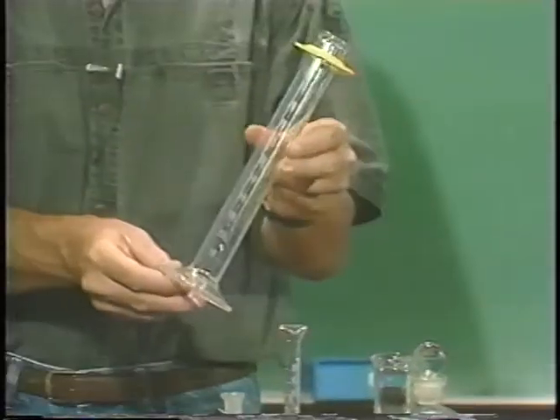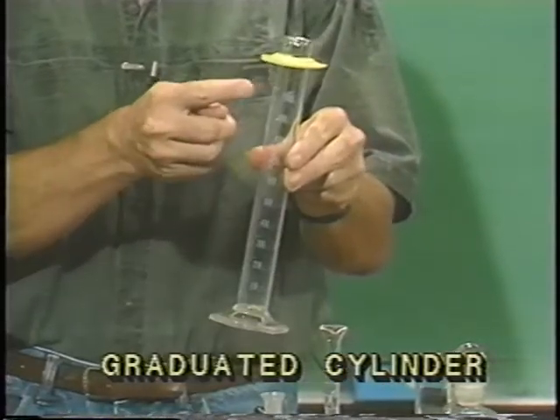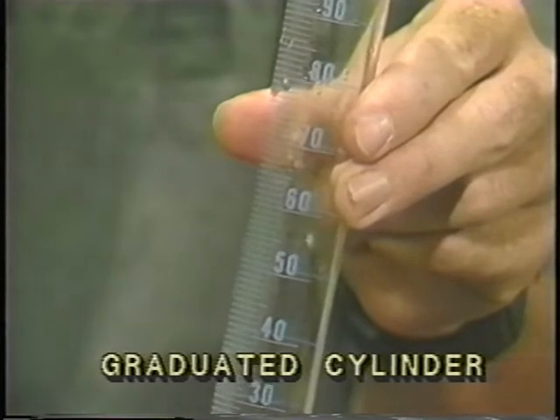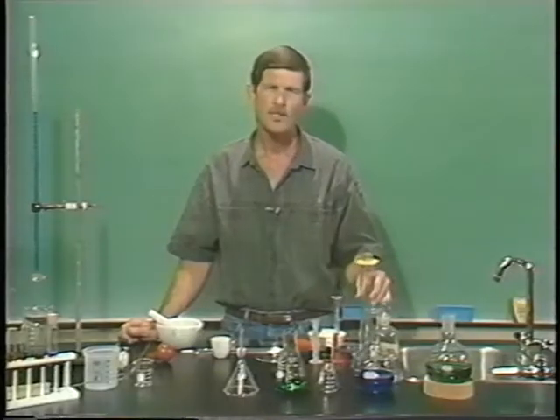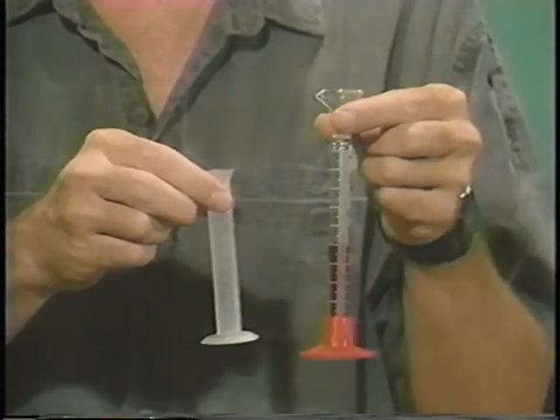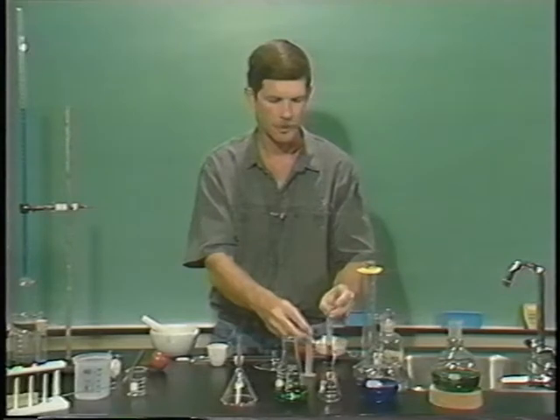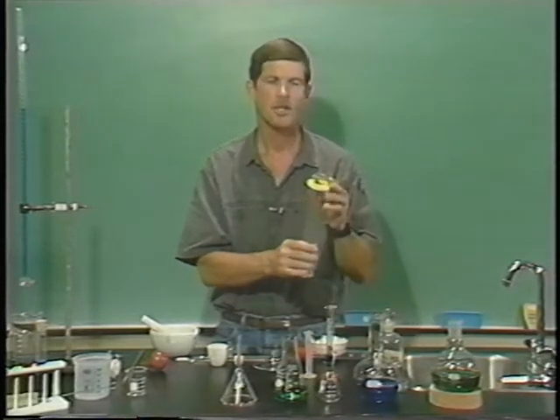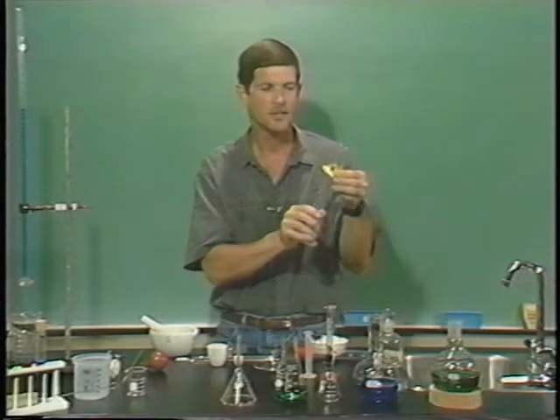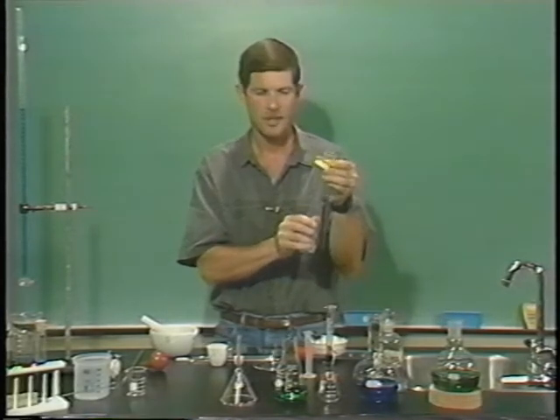You can remember the name of this because it's cylindrical in shape and has marks or graduations along the outside, usually in milliliters. Graduated cylinders come in all sizes. These two both hold only 10 milliliters. One is made of plastic, the other is made of glass. Incidentally, the ring around the top of these is called a cylinder guard. It's not meant to be slid down to measure liquids. It always stays at the top.